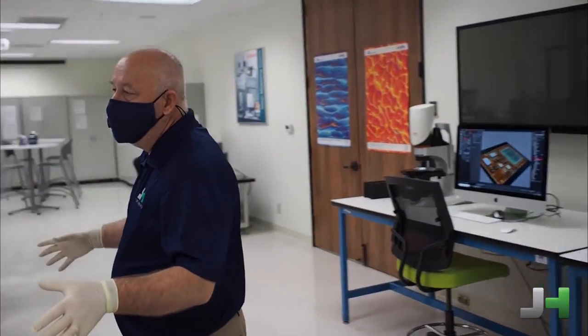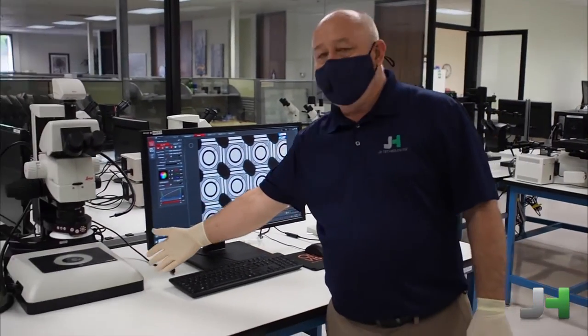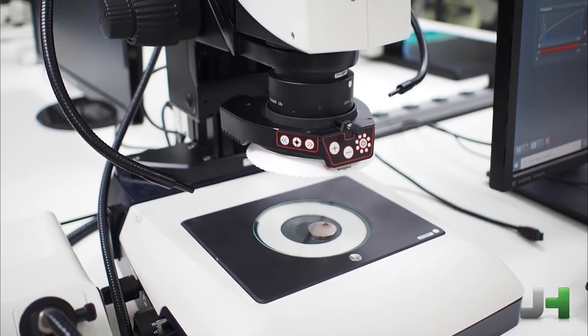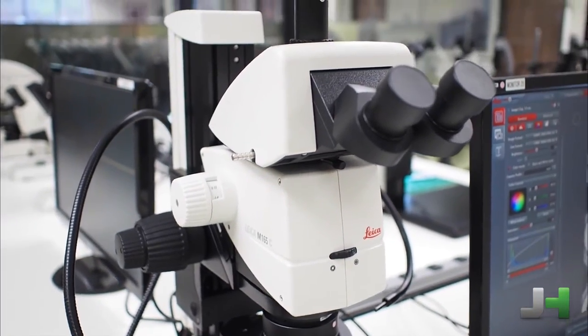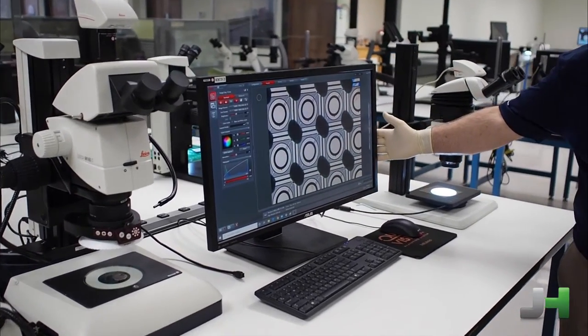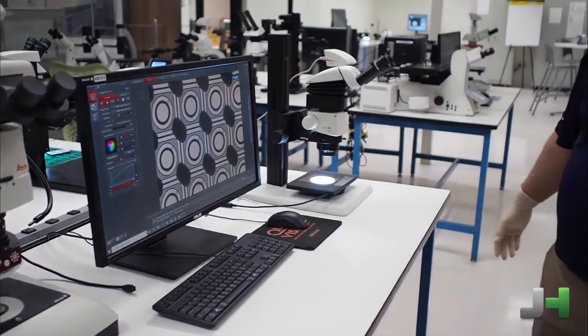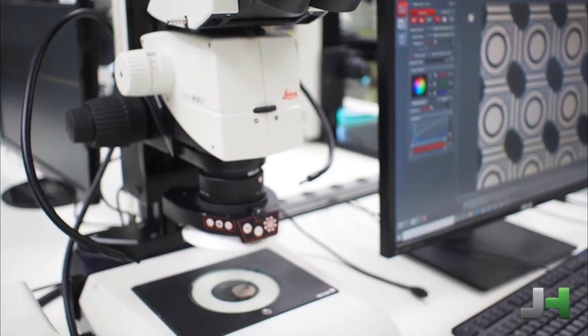Along with the basic microscopes, we do carry research-grade stereo microscopes. This is a Leica M205 with ergonomic eyepieces and is really set up to have a full suite of software around for measurement, image analysis, image grabbing, movie making, a variety of things in the software.